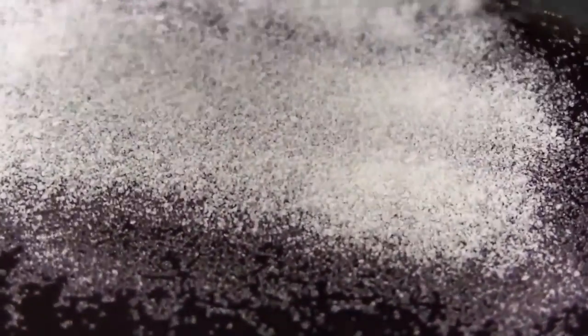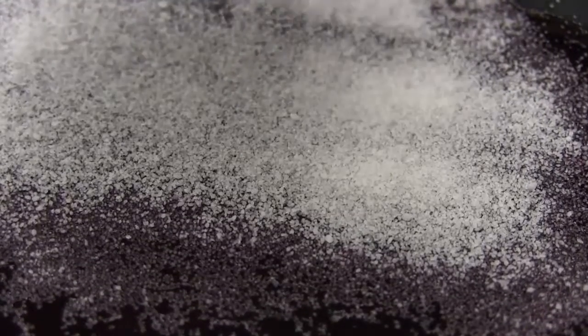The granules will quickly begin to encapsulate and solidify the spill within minutes.